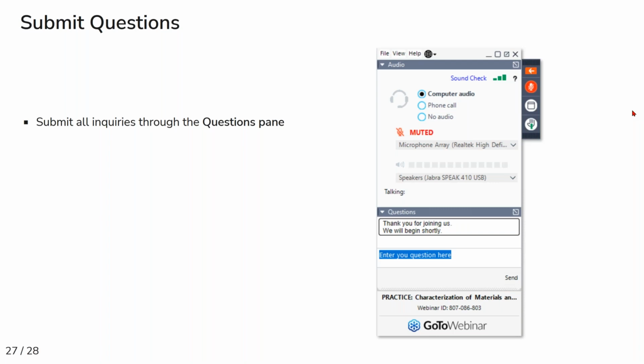Got it, thank you. And I remember you did mention the antibody that you had used. Sometimes you only see one antibody bound to one of the monomers. Do you remember how strongly the antibody binds? What is the KD value? Might that be the reason, and maybe better antibodies need to be generated to make sure the heterogeneity is less? Do you think that's a possibility?